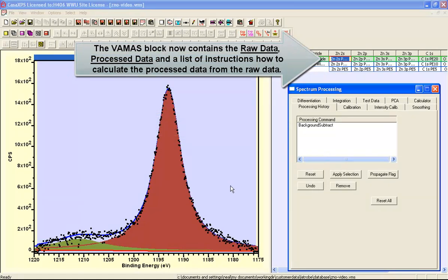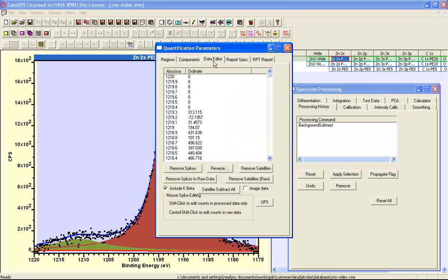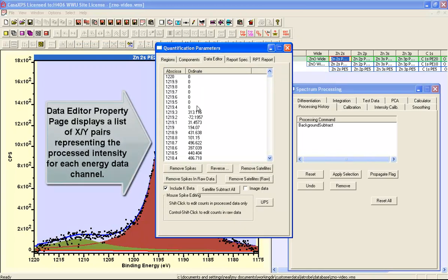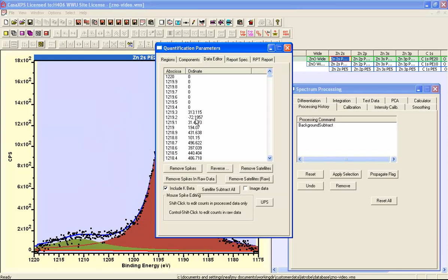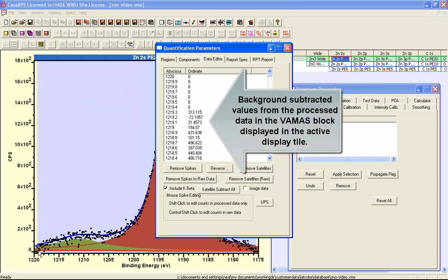From the data, so that when we look at the data editor you can see that the values assigned to the ordinate are all background subtracted — some of them are zero and some of them are negative. This is because we have removed the background by performing the mathematical subtraction of the background from the raw data.